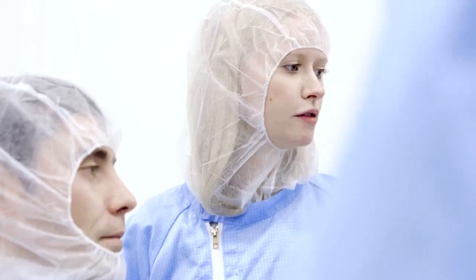We at SCHOTT always strive for optimizing and stabilizing our processes. We have been producing coated vials in Mülheim for roughly 20 years, so there's a lot of experience already by now.